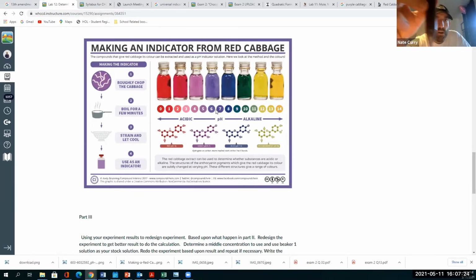Mine is like dark blood red. I don't get that color at all. Your color is right down here. Look, it's on the screen. I mean, it literally looks like a vial of blood. Okay, so that probably means the water they gave you was probably not distilled. I guarantee you they just went over to the sink and filled them up.